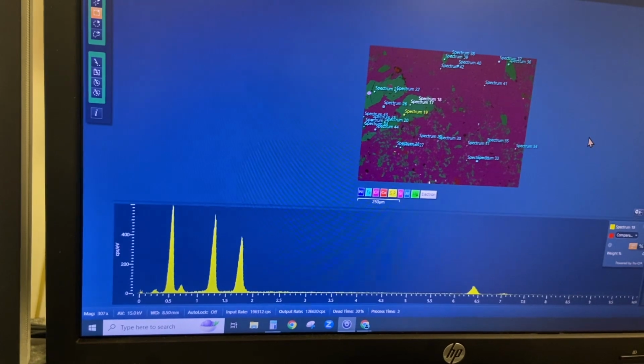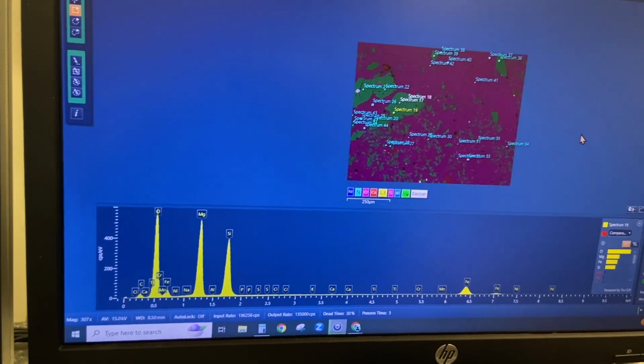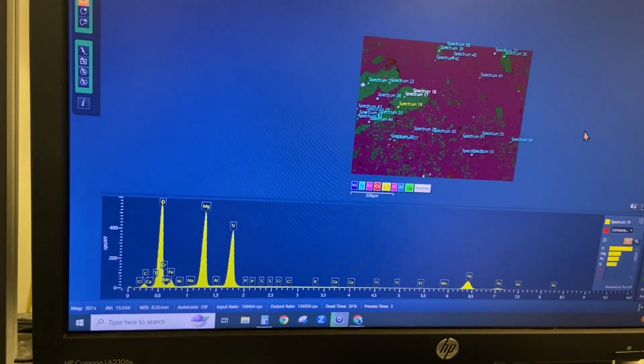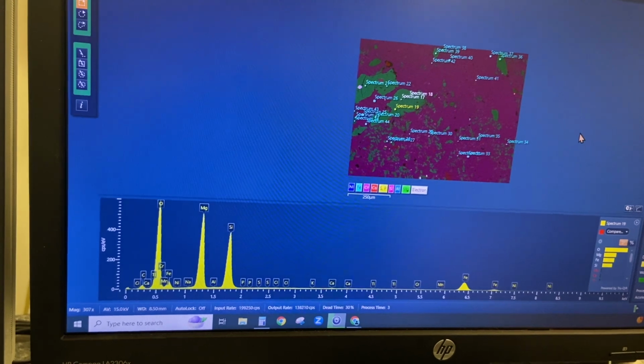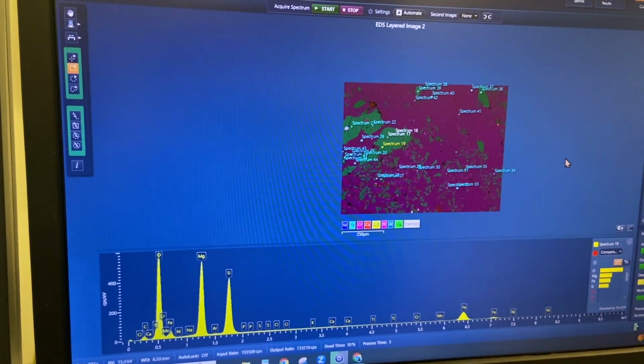It's weird. I found spinel-rich clasts, but not a pink spinel troctolite, which are sort of the staple in lunar science for samples having pink spinel in them. So it's always cool to find new things. And I found some plagioclase in that clast too, so even better. So yeah, that's it for today.